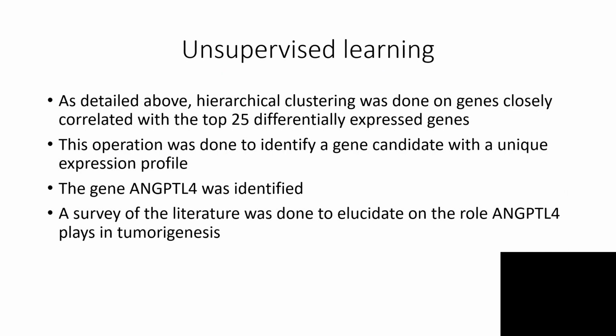And then we move to unsupervised learning. I just want to briefly highlight one of the important reasons why I did a correlation analysis in addition to the differential expression analysis. It's always challenging to truncate your data set enough so you can produce meaningful dendrograms in the context of hierarchical clusters. If you have too many genes, you'll wind up with clusters at the bottom where the gene names overlap each other, and the dendrogram is simply not readable and not comprehensible.